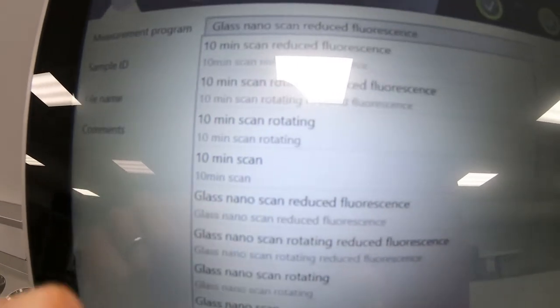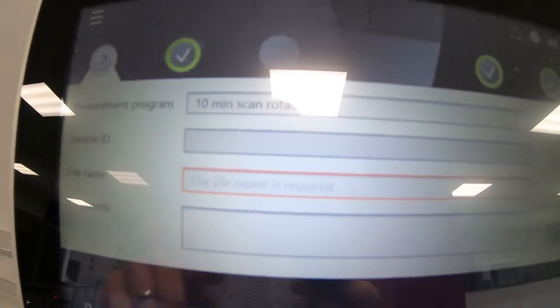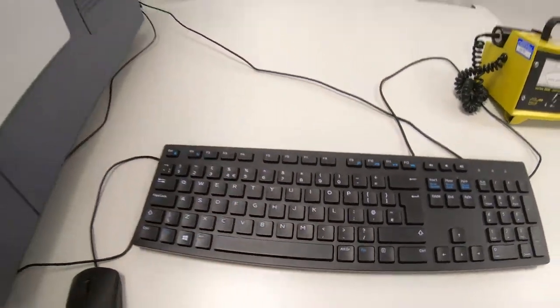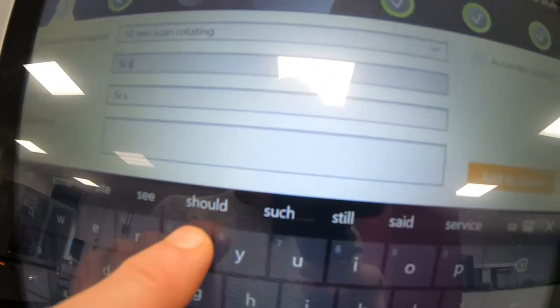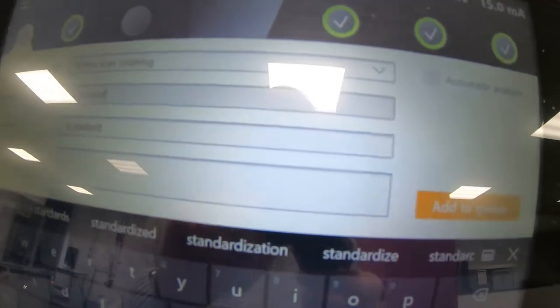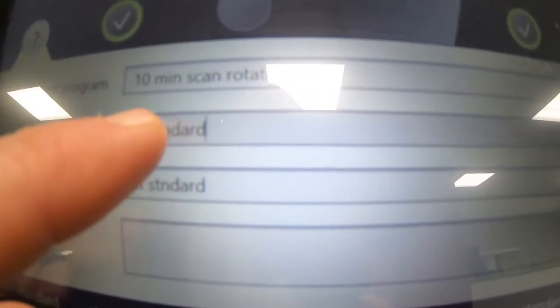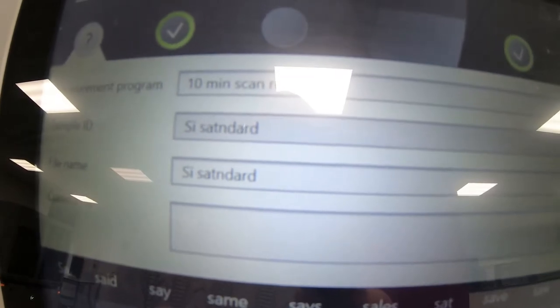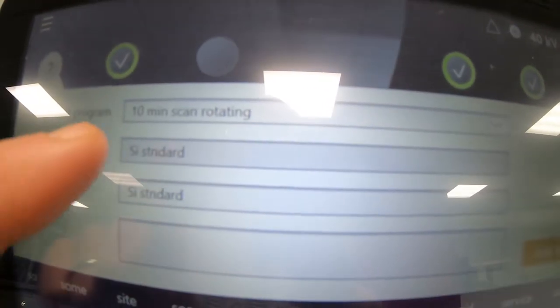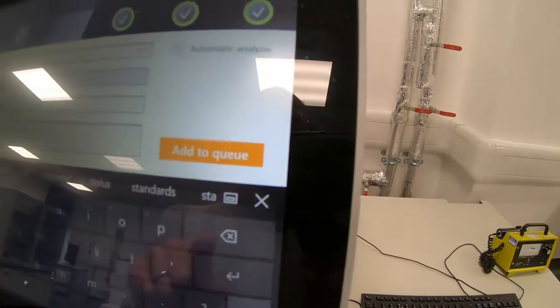So today I've got a standard sample, so I'm going to go over here and type it in manually. I'm going to type in here Si standard. You can see that sample ID and the file name is exactly the same. I've got a bit of an error in there so I can go in and correct it. There we go. I can type and we're ready to go.